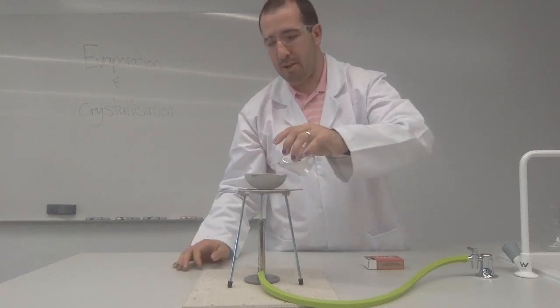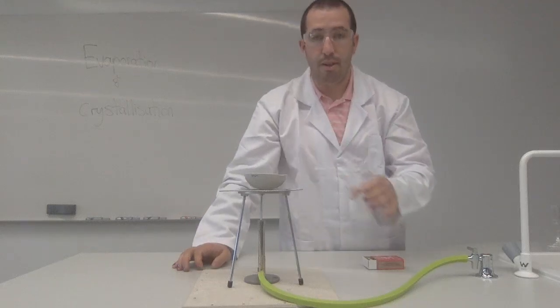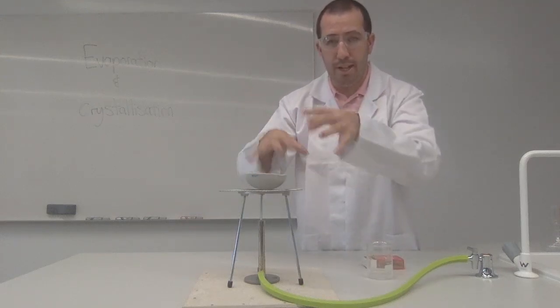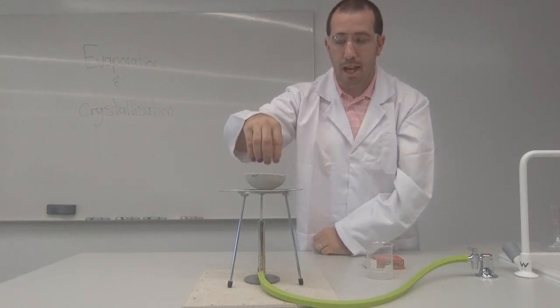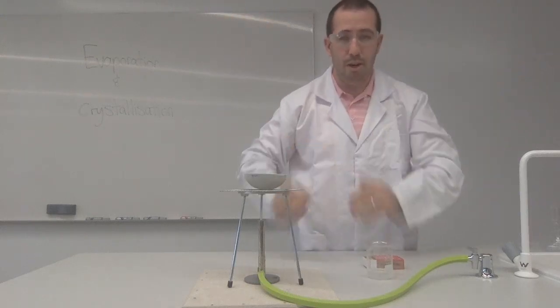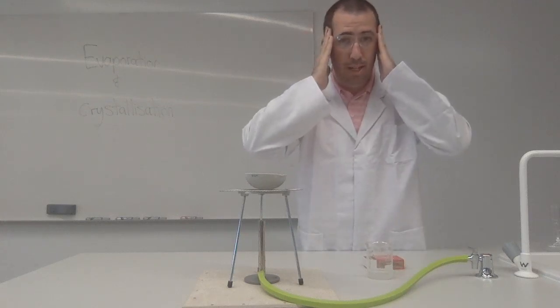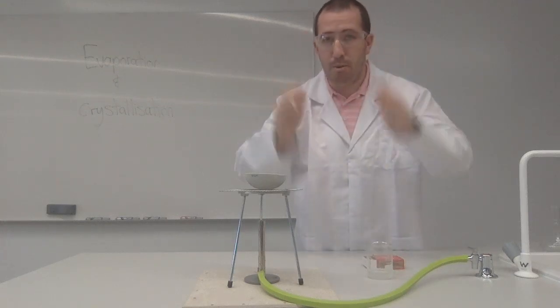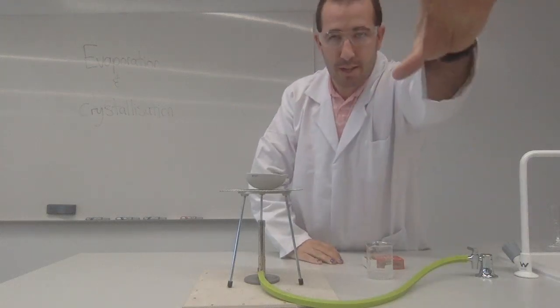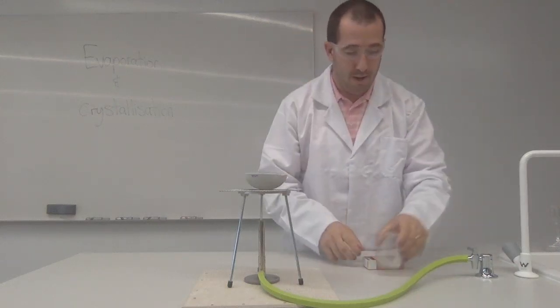Now, what you might find when you're doing this process is that it can be relatively unsafe. What do we mean? When the liquid starts to evaporate out, there's a lot of energy contained within this evaporating basin, and that means things can start flying off. As you might see on the video, something's flying off. Hopefully you're wearing safety goggles like me so you don't get hurt, because particles can fly into your face and might hurt you. So remember, safety first. All right, let's begin this.